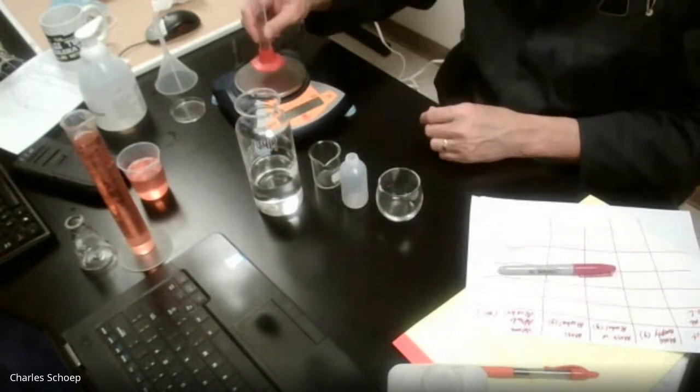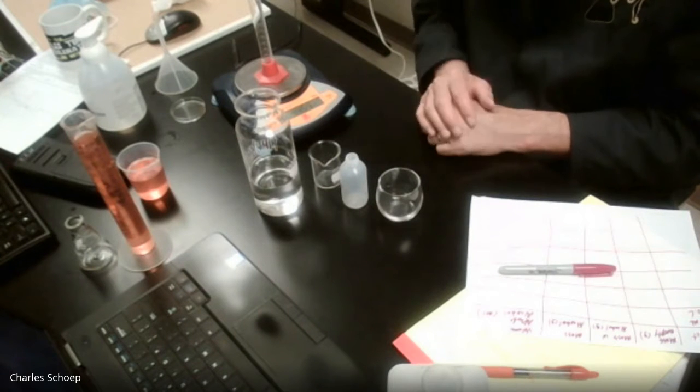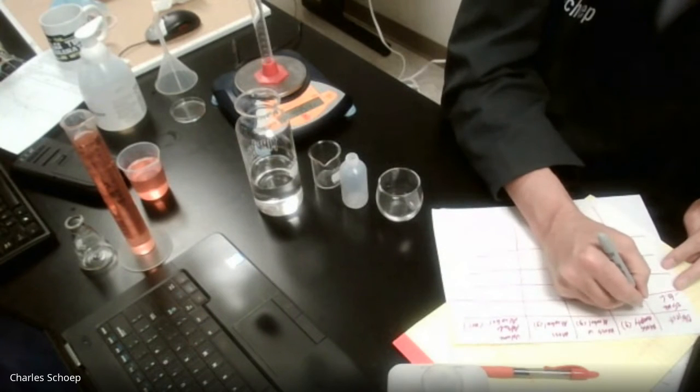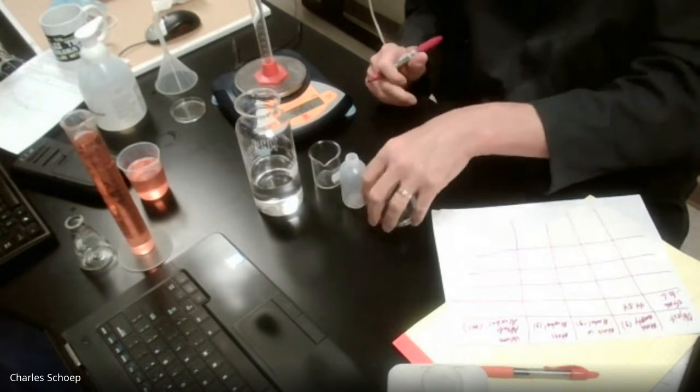I'm going to put that on my balance, and that has a mass of 44.54. So the mass of empty is 44.54.